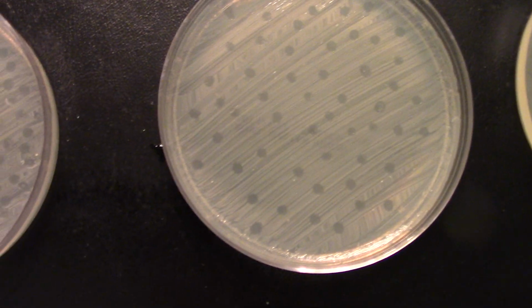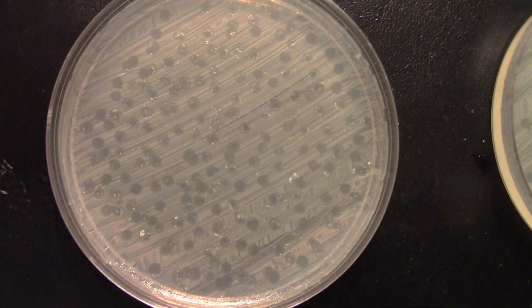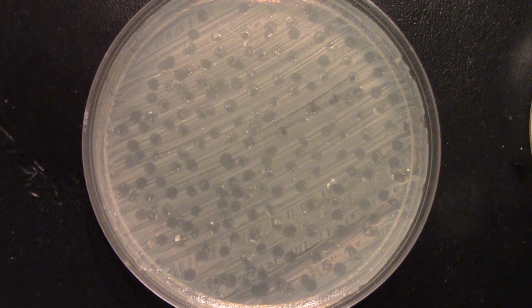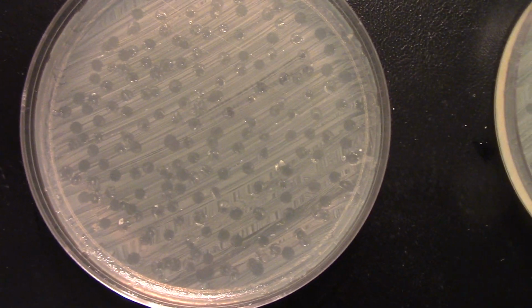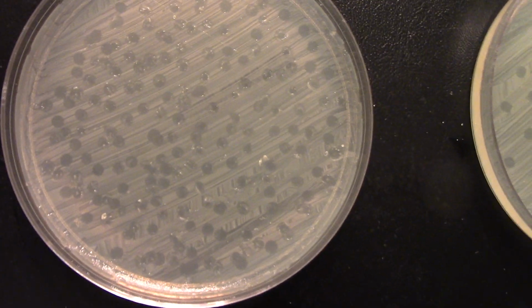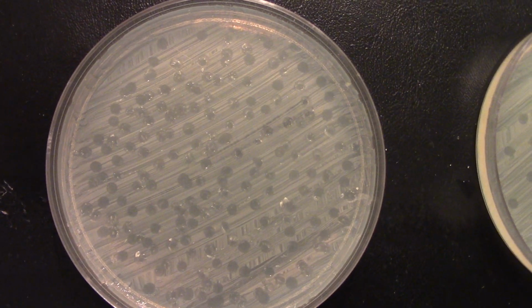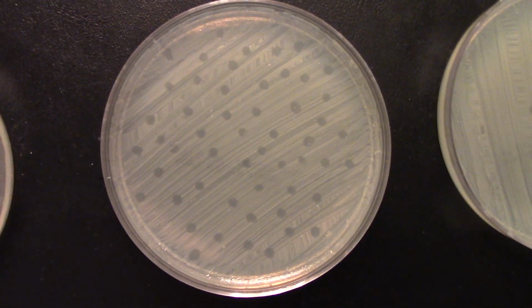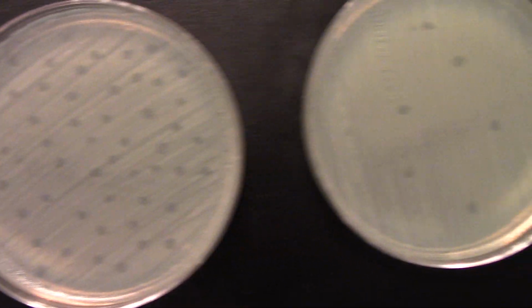Okay. Now the information, I don't want to give it all out just by telling you during this presentation. That will be accomplished through reading and writing a lab report on the viral plaque assay and the concept of serial dilutions. So once again, these are our results. We have our tube number 2 of a 10-fold serial dilution, tube number 3 of our 10-fold serial dilution, and tube number 4.